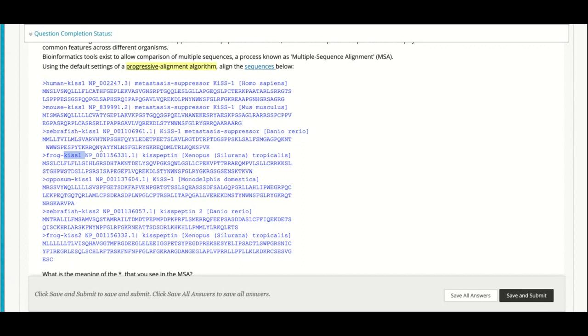All right, so how do I compare them? You will open a new window, and I'm just going to type Clustal. And let me see, is it sharing? Oh, okay, so now let me share the next window with you.